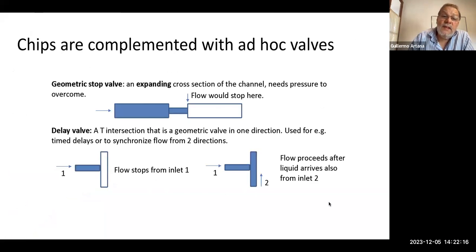These chips are usually accompanied, or can be accompanied, by some valves, in which you stop the flow and have a break of the process there.